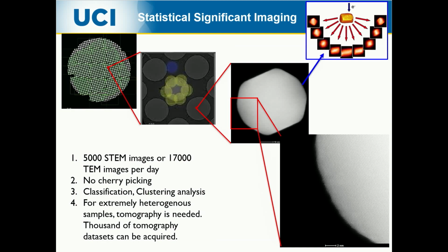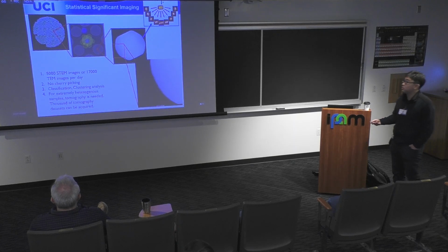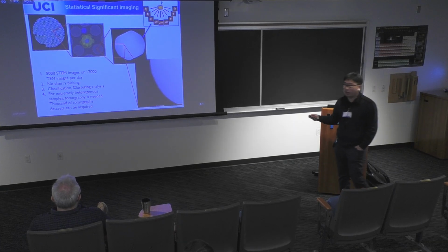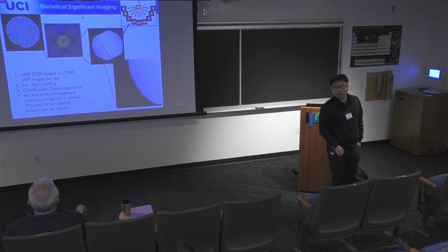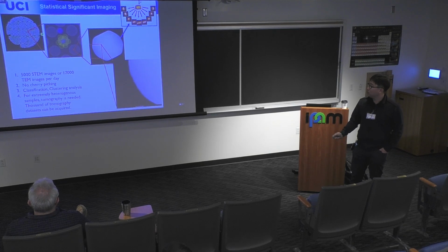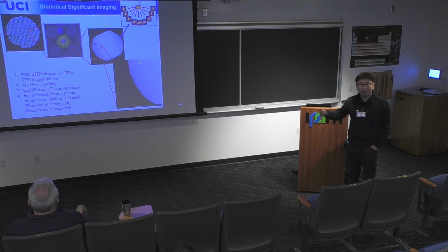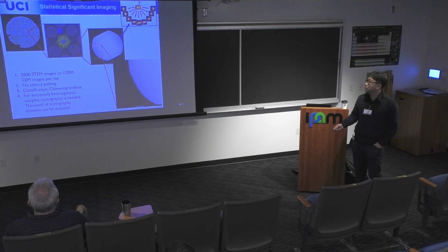So this is the thing we'll need to address, the electron microscopy, or any microscopy, paradox. We're looking at one small area at a time. How do we actually achieve statistically significant imaging, right? From an entire grid that's 3 millimeter by 3 millimeter all the way down to 1 angstrom, right? So this is really the question: how do you sample this whole area that's so large and give atomic resolution images, right?